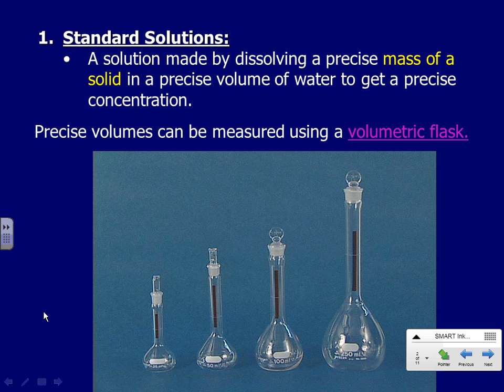That's because if we want to get a volume very precisely, we want it to be in a skinny tube where we determine where we're going to stop, because any tiny little volume addition in that skinny little tube will cause the level to rise very quickly. As we come to this point, the level rises very quickly. We slow down, we add maybe with a beaker and then with a dropper, and on all volumetric flasks, there will be a little line that indicates where to stop adding. I'm actually just clicking my nail on it. It's an etched line in this case.